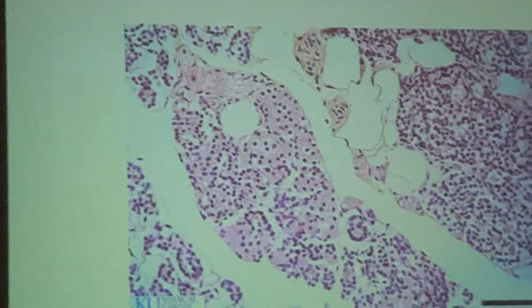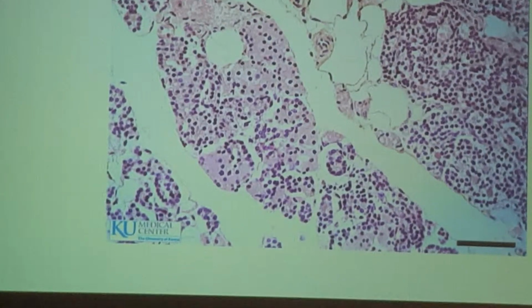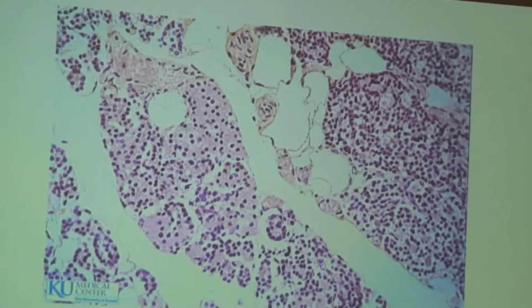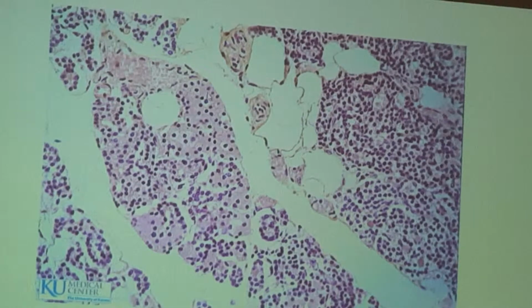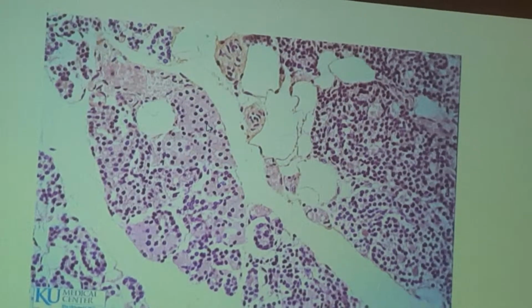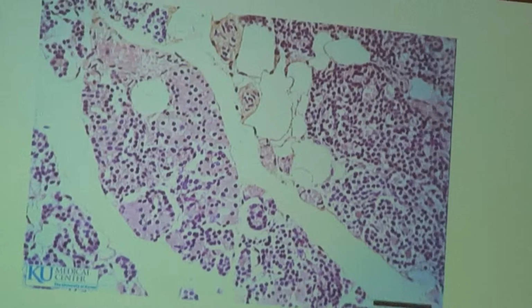13, name the organ, parathyroid gland. Again, new for today, so if you missed one, it's probably one of these. Parathyroid gland. And then I asked you to identify these cells over here. These are oxyphils. Oxyphils, remember, you can see the cytoplasm. So I can see the nucleus, and I can see pink cytoplasm around it. That makes these oxyphils.